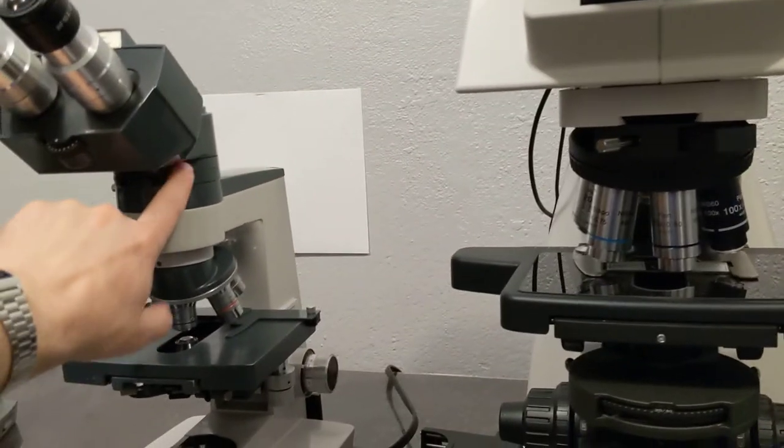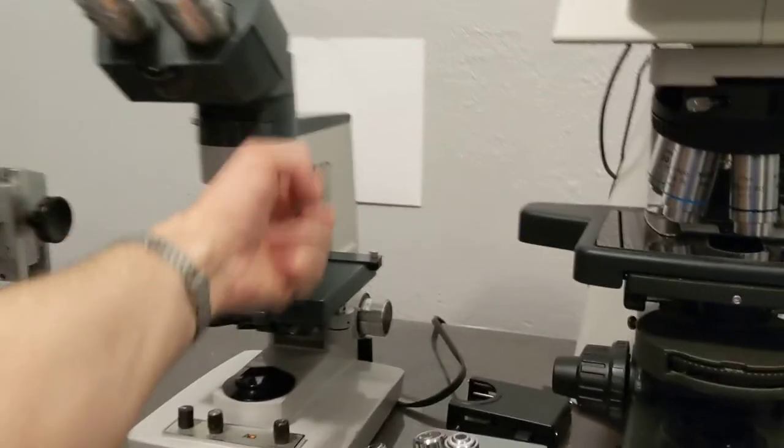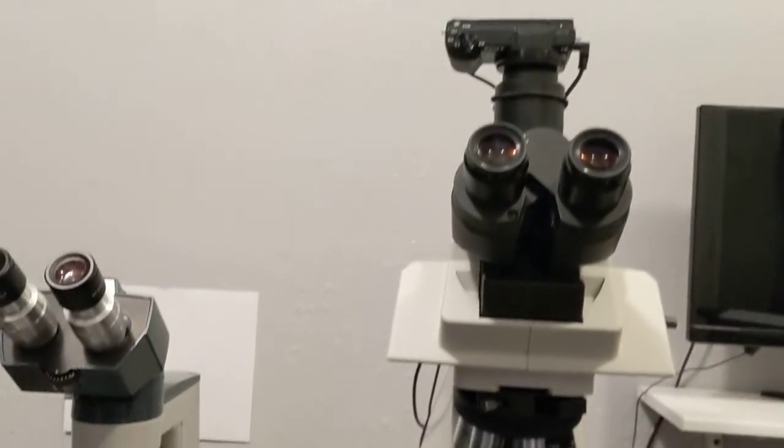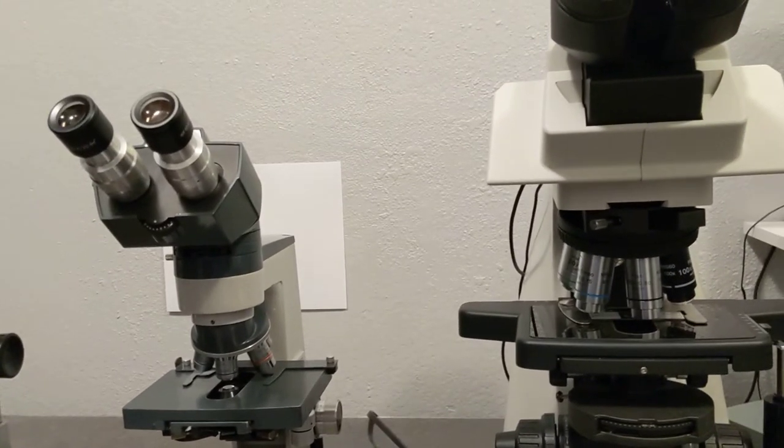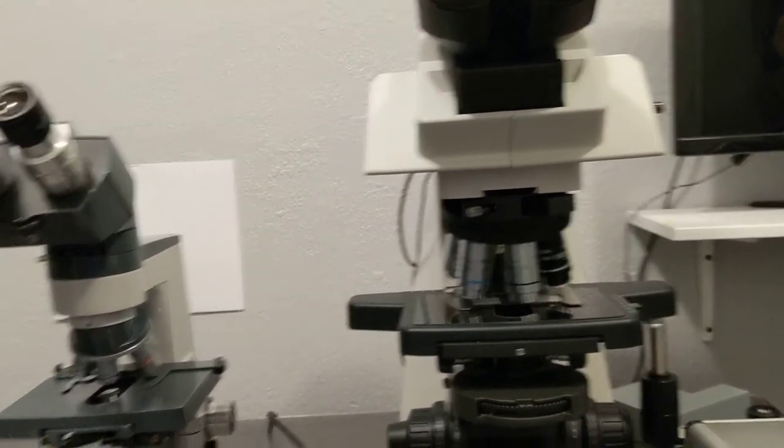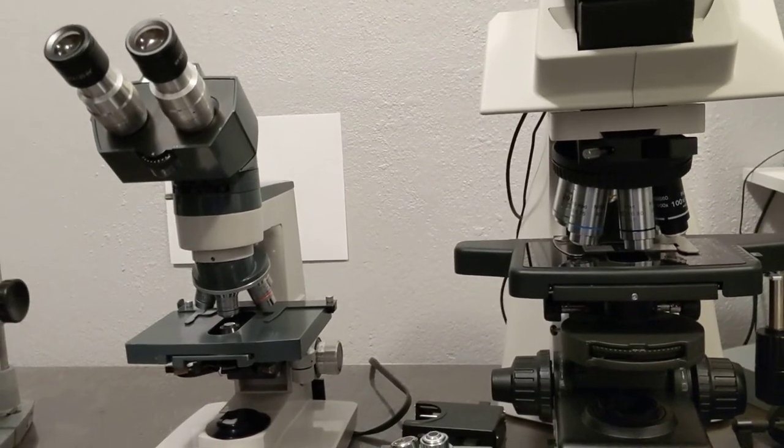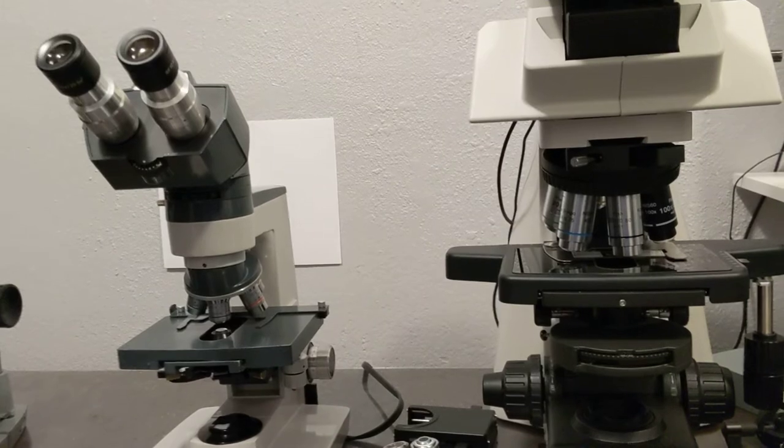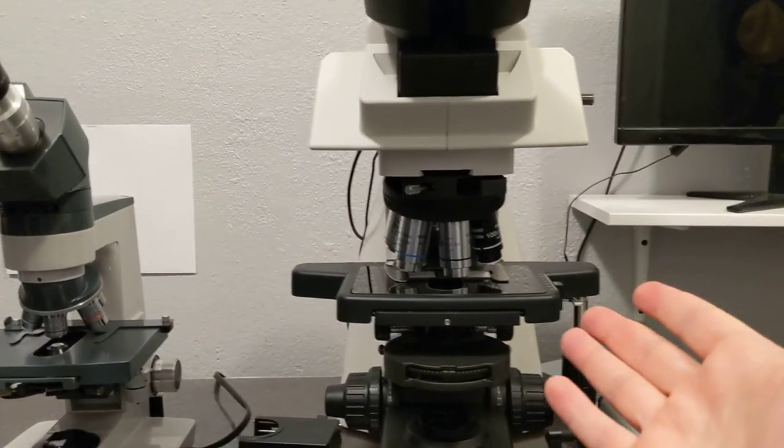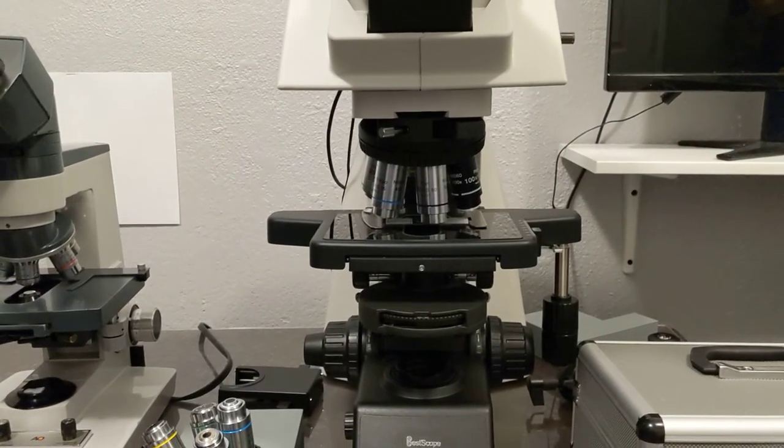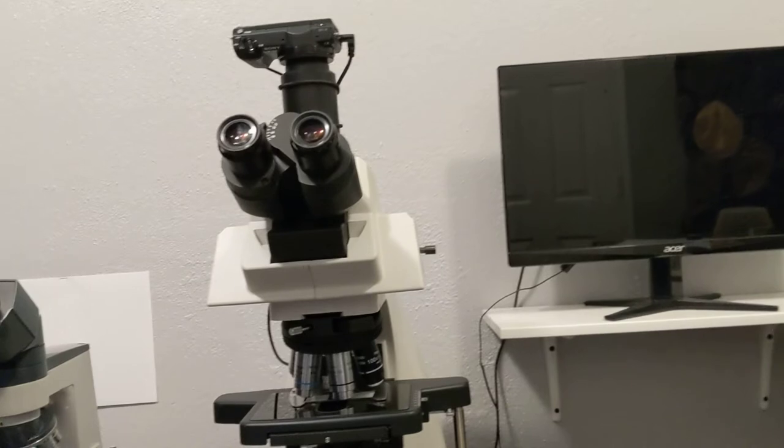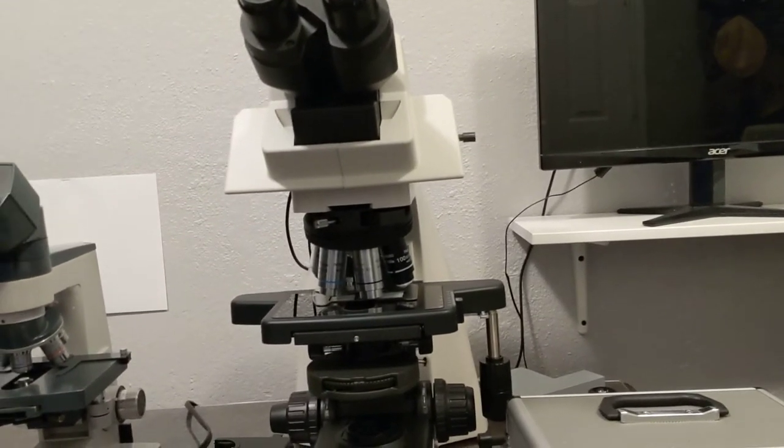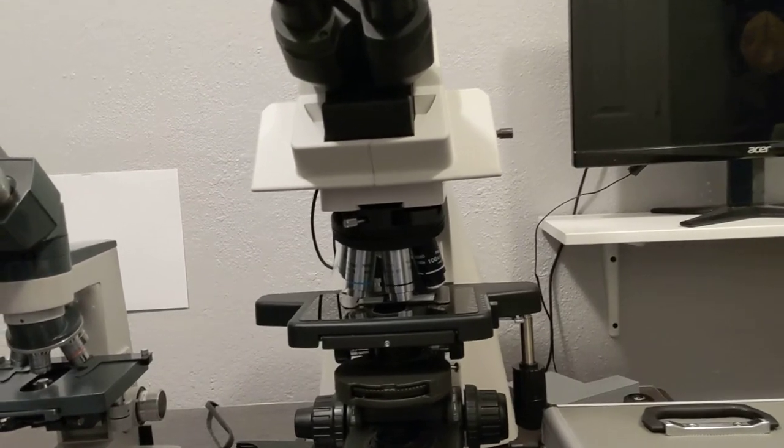The optical performance of this new microscope is just so much better than what I'm used to with my American Optical. American Optical is really good with 10x and 20x. The 40x was okay, not nearly as good as my 40x here. The 100x, I tried a whole bunch of different plan 100xs with oil, and I just never really got a good picture. With this, I use 100x all the time because it's easy and the picture comes through really clear. I went in to buy this microscope thinking I'm not one of those people that uses 100x, but now that I have it with water immersion, I use it a lot.